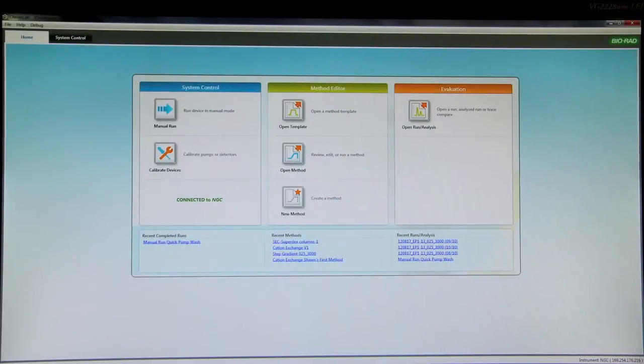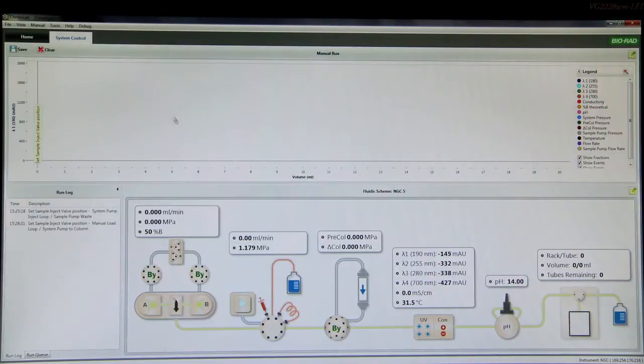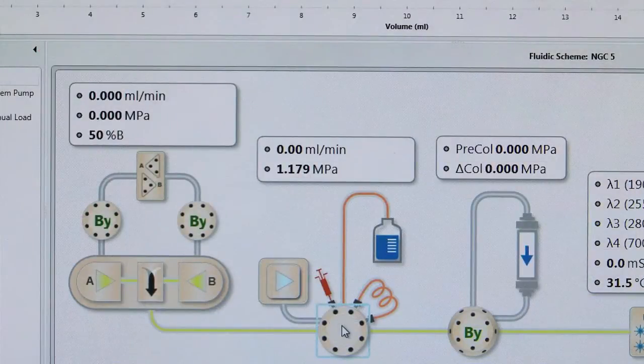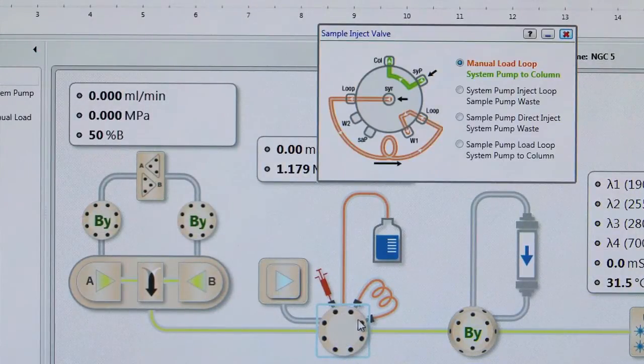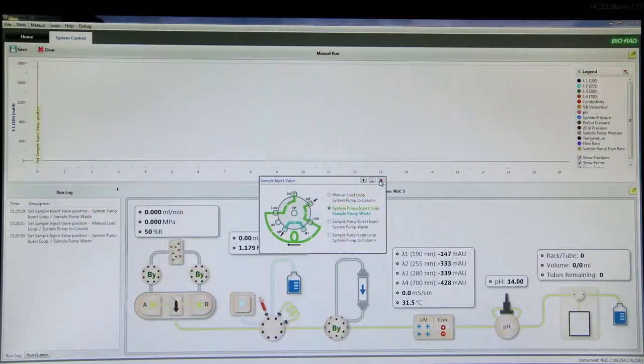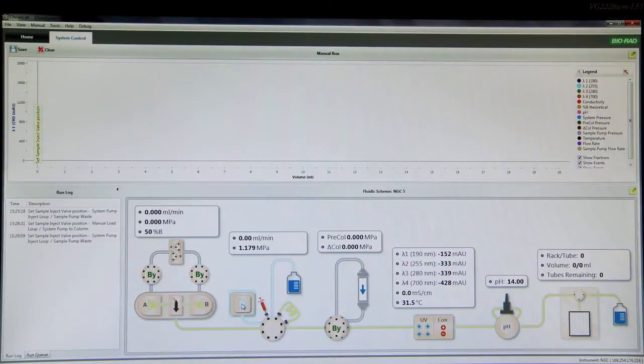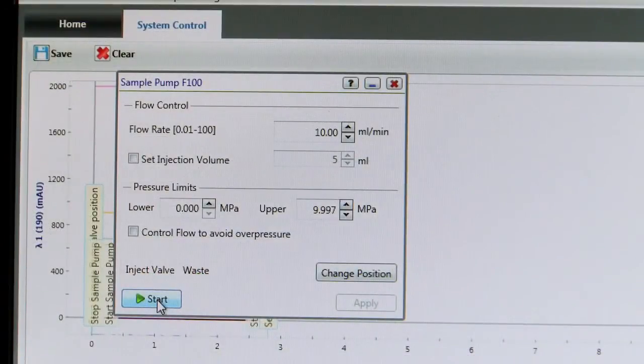You can also use ChromeLab to purge the sample pump. Select Manual Run in the home screen. Double-click the Inject Valve icon and select System Pump Inject Loop. Double-click the Sample Pump icon and set the flow rate to 10 milliliters per minute. Click Start to start the purge.